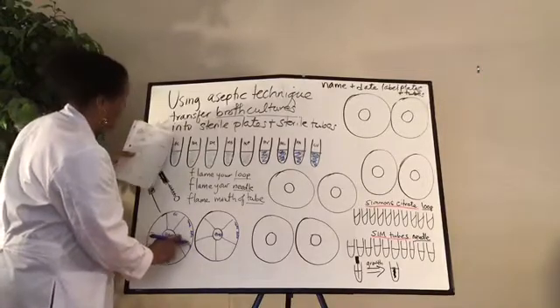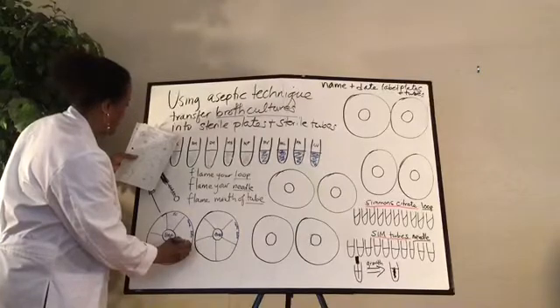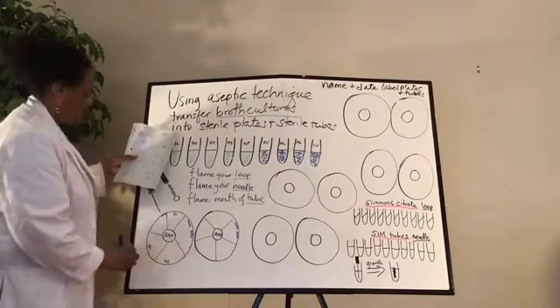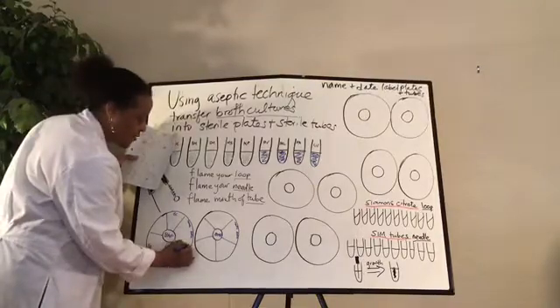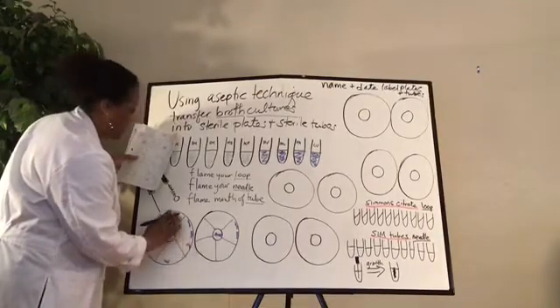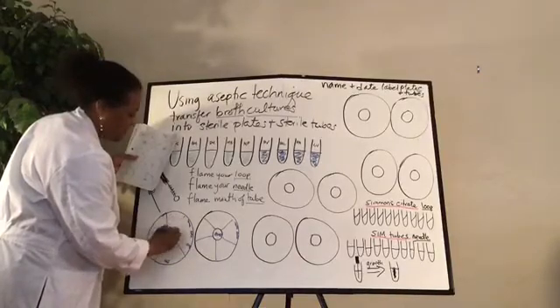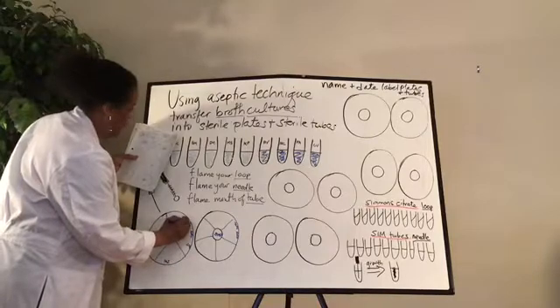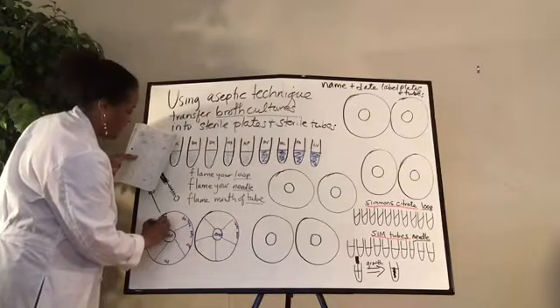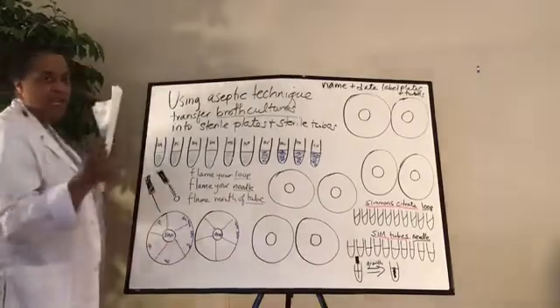Oh, okay. This should be SA, MS, SM, so that's correct. Got a little off. I'm just going to make this the way this is, like this. And this should be BM and then E. coli. So I want it in that arrangement, so when I'm looking at it, I can see it really quickly.